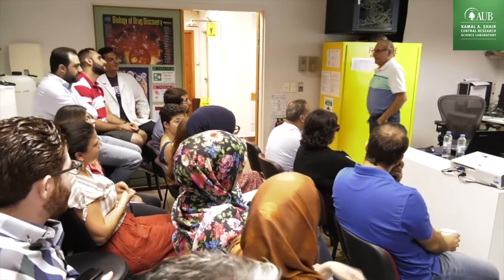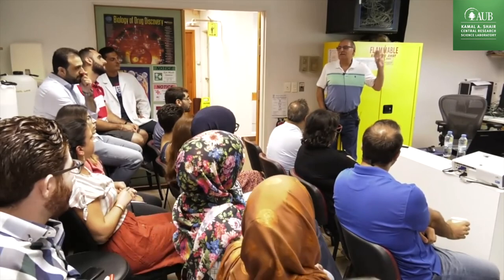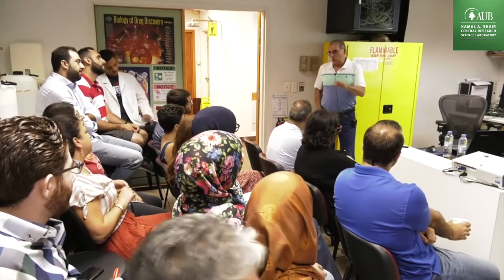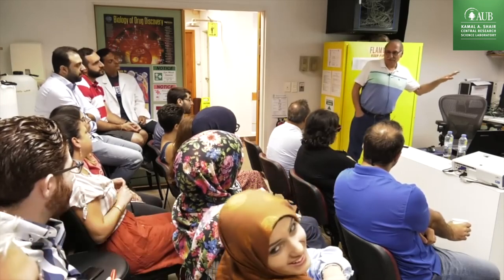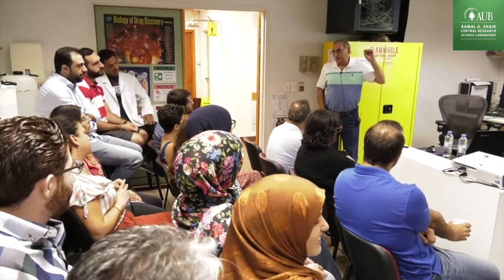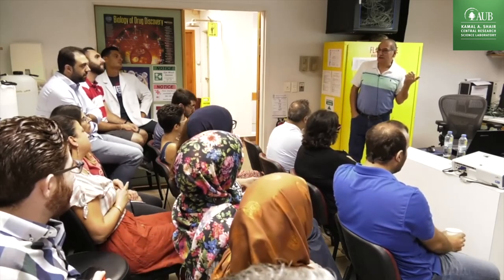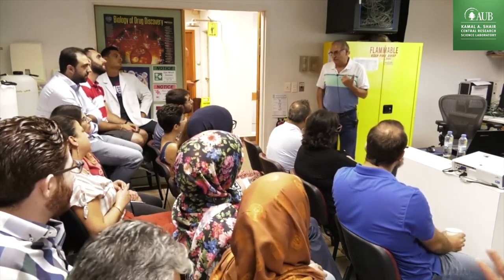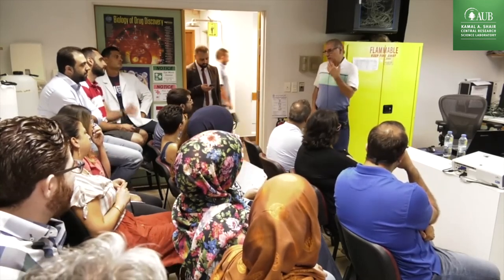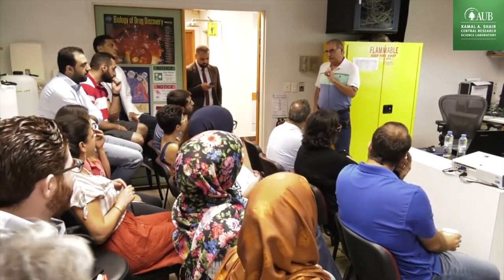Good questions. What I showed you here has only been done at room temperature and atmospheric pressure. Now, when I go to my reaction conditions, high temperature and high pressure, the situation will be completely different. I didn't mention this because I don't want to scare you too much, but nowadays all these characterizations are done at the reaction conditions, pressure and temperature. If you have a reactor and you work at high temperature and high pressure, you need to characterize your catalyst at that condition.